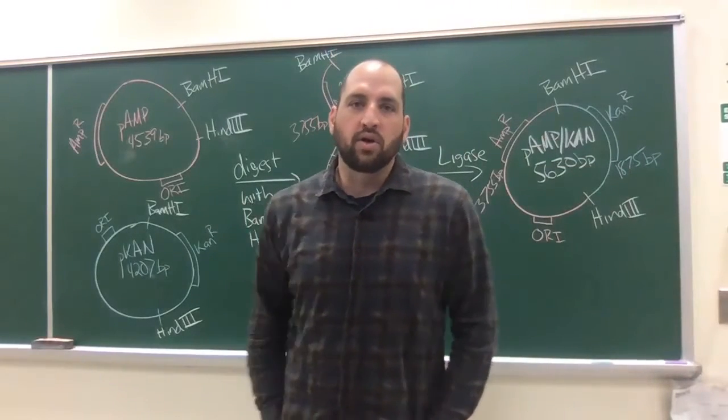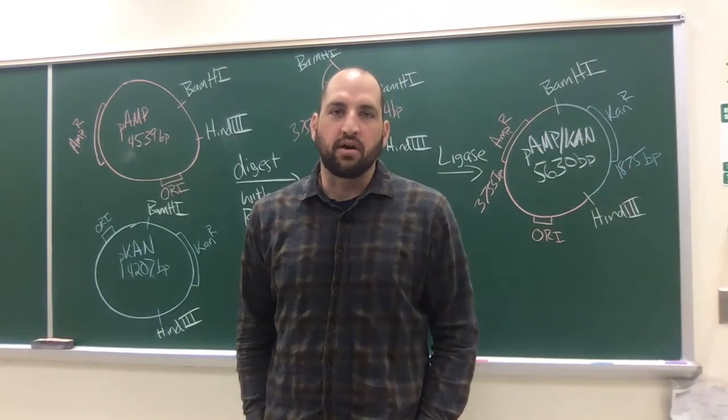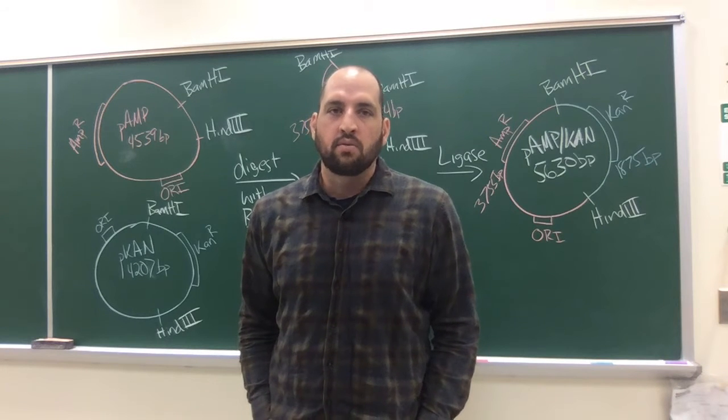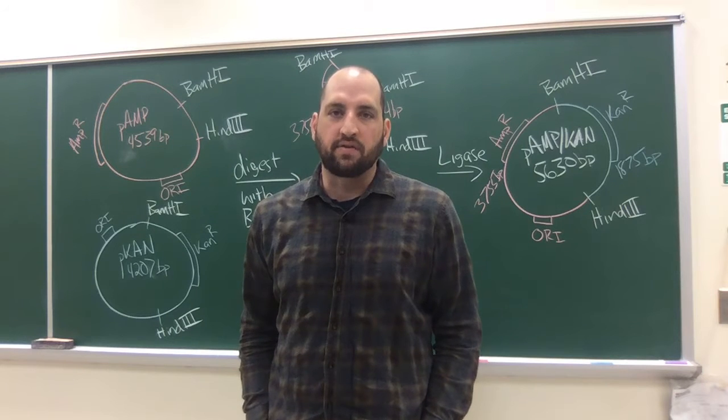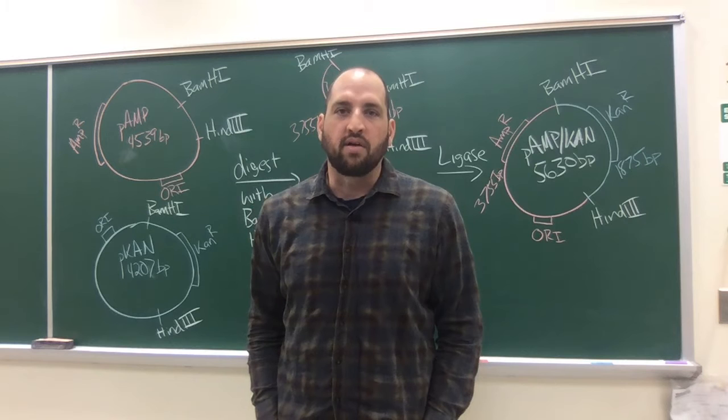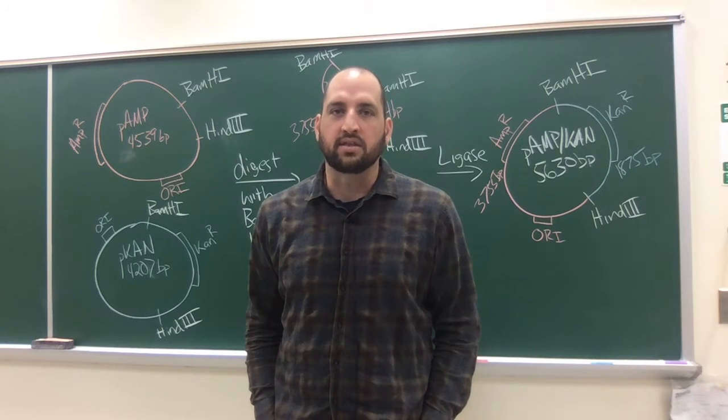Okay, y'all. Welcome to the first part of transforming bacteria with plasmid. What I want to do with this video is set up where we left off after lab number 7 and talk about the front matter, what you're supposed to be doing to get this lab started.